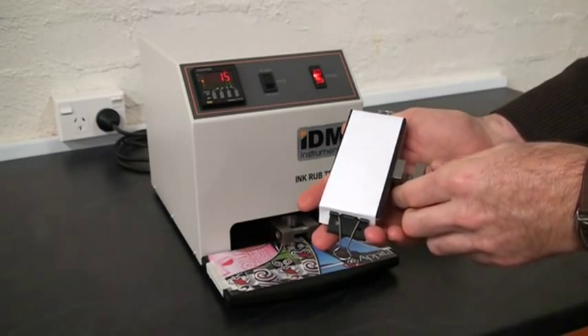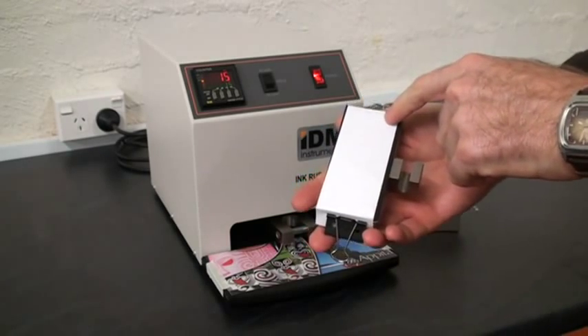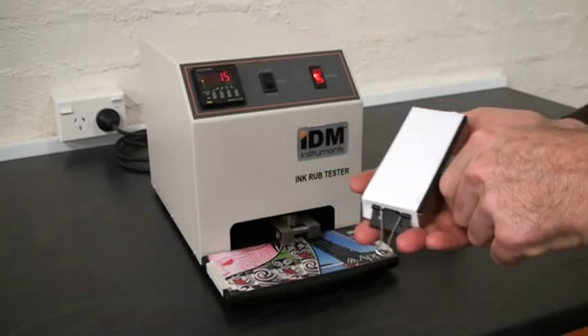In this instance, after 15 rubs, we have a little bit of scuffing here and just up here.